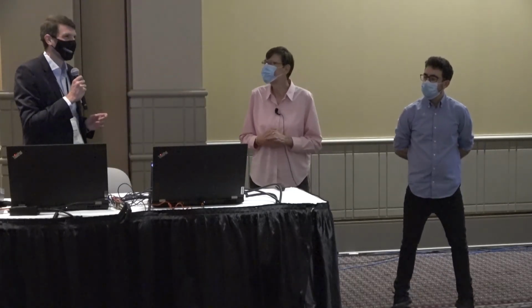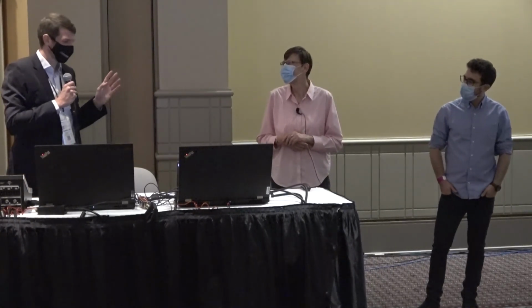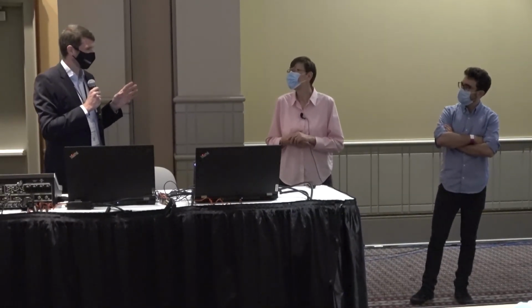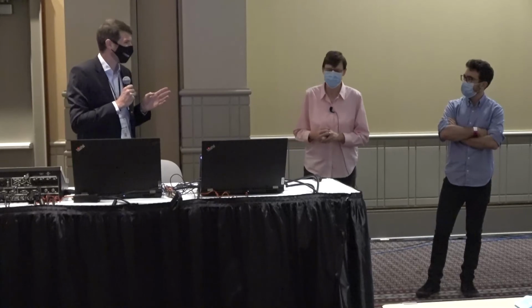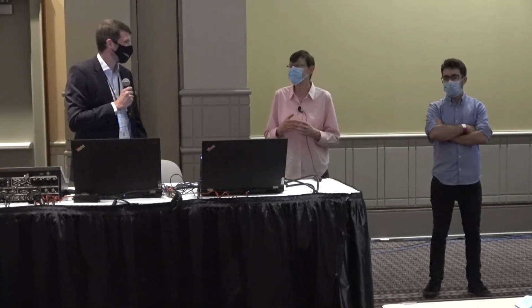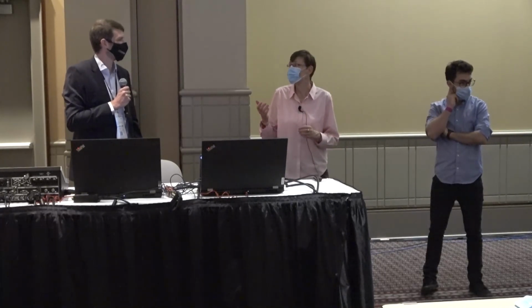I have a quick question for Birgit as well. So this nutritional supplement, yes. I'm just wondering what it might look like. In peroxisomes, there's alpha oxidation. So is it reasonable to assume that this might be a beta-branched fatty acid? Yeah, I think you're in the right direction. I think it's a fatty acid derivative. The nice thing about that is that it's something that we would eat anyway, so it's all FDA approved, and we actually did some work even in monkeys.